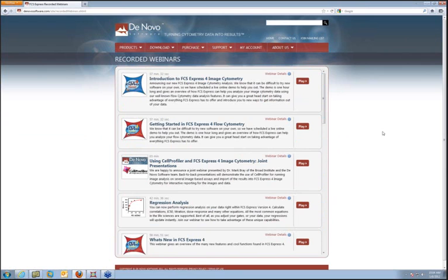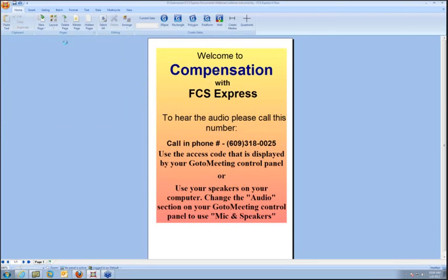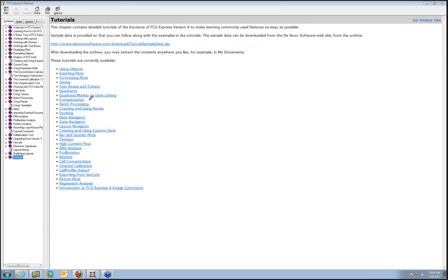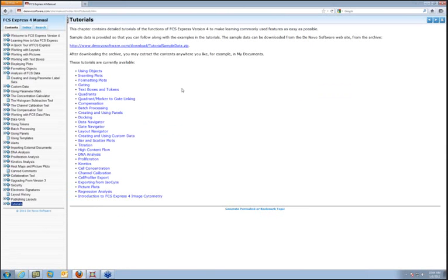In addition, everything that I'm going to be showing is going to be available in our tutorials. Actually, this will be a briefer version than our tutorials. Our tutorials are more comprehensive. The tutorials are always available from the main menu if you go to Help, Tutorials, and you can see here that it popped up and that we have a compensation tutorial available right over here. And as well, the tutorials are always available from our website. If you go to Support, Tutorials, then you can see the tutorials on our website over there, and they come up as well. Okay, so without much further ado, let me get started over here.